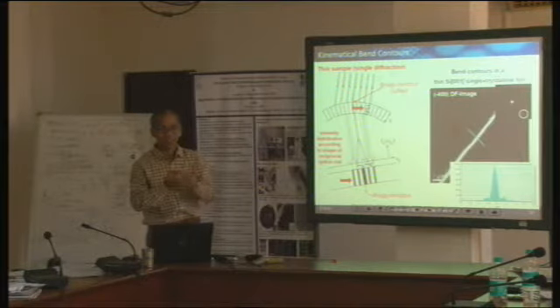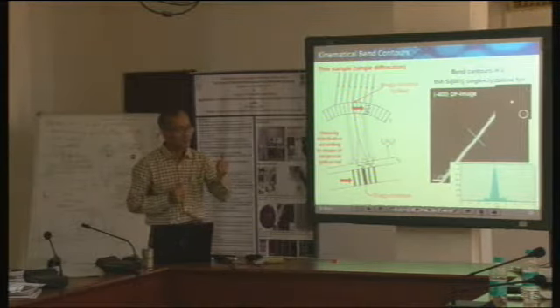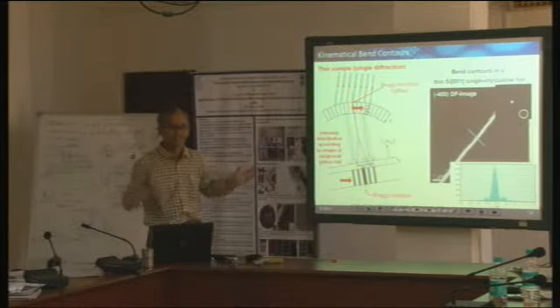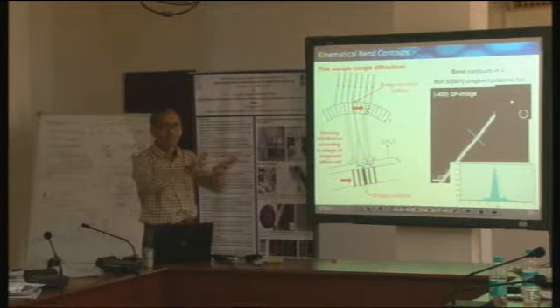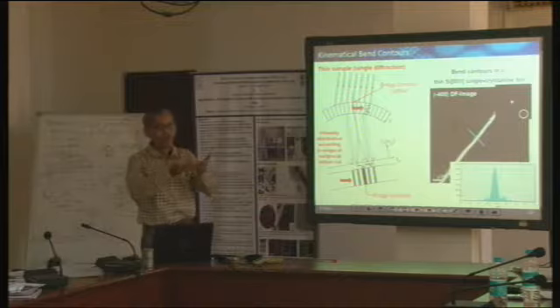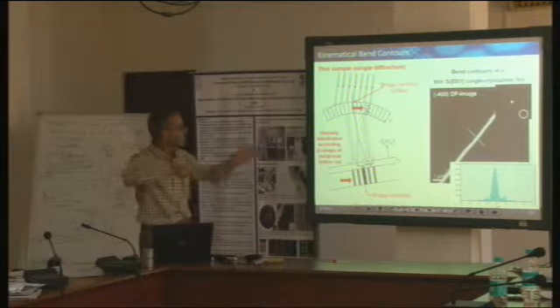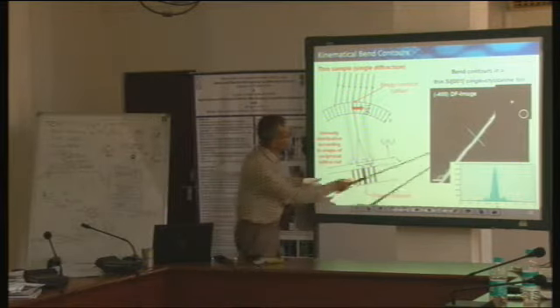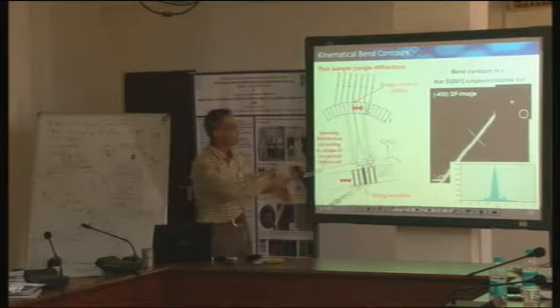That makes sense. That's why you will not even be able to recognize what my sample is. You will not feel like you are looking at my sample. It is by and large hidden. It is dark, because there is no other contrast. The only contrast is this one, so you will just see a line like this. If I say this is the image of my sample, you don't even know where the hole is, where the sample is beginning.